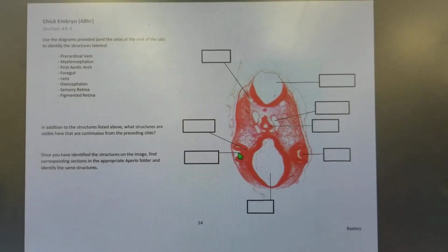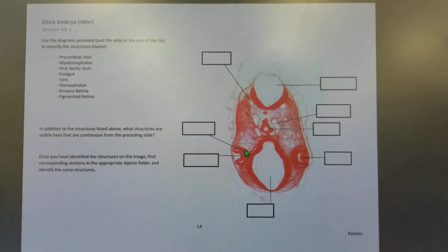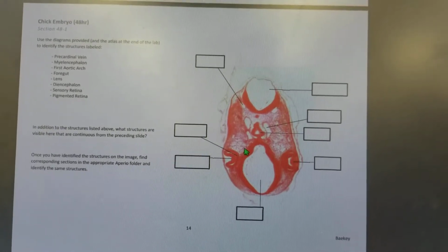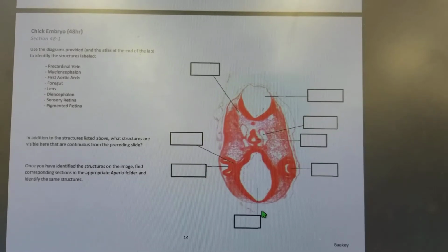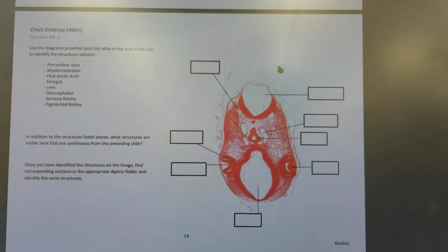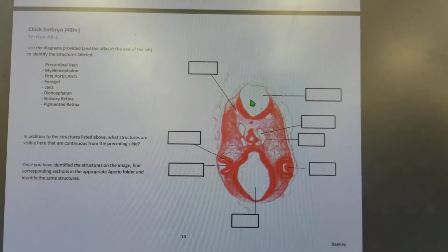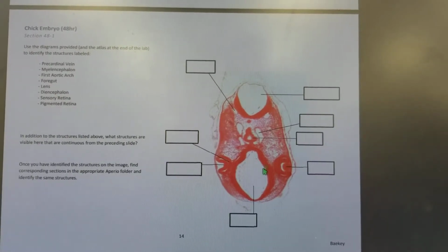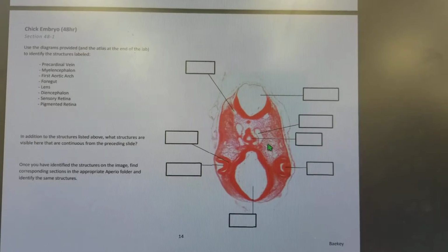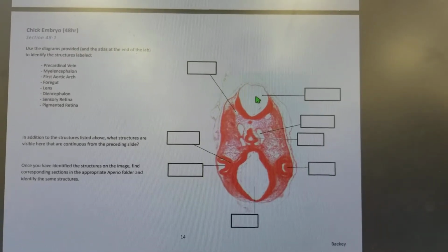So what is dorsal and what is ventral to this image? Not really a fair question. That's why I asked it, because really this is cranial and this is caudal. This is the head at this location, but as we move backward, this is neuroectoderm as well, right? And we've got a section through the diencephalon and what is referred to as the myelencephalon, okay?